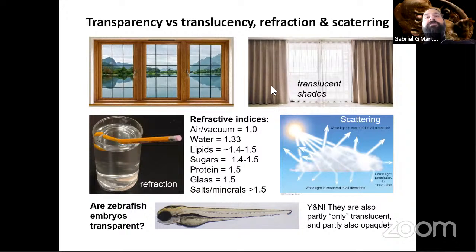So if a biological material is completely opaque, there isn't much we can do with that biological material inside a microscope. Looking at things in biological materials in microscopes requires that light actually goes through the biological material and interacts with it. And that somehow on the other end of the optical path, we can generate an image that gives us information about what's inside the biological material. That isn't to say that there isn't anything interesting on the surface, if we could eventually just watch the surface, but that would be a topic of other lectures.